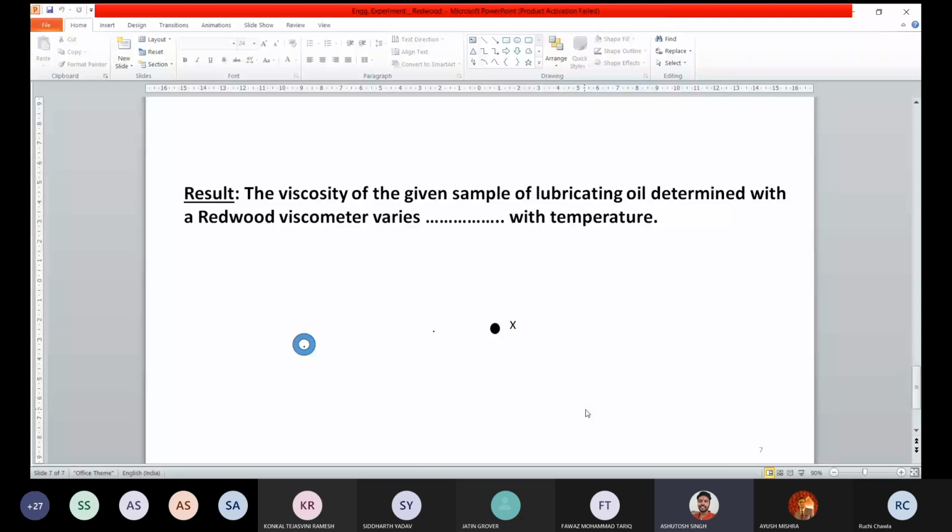Yes, ma'am. So when you make a point, it should be made with a very light hand, with a pencil you will be using on the graph. Now, if that point has been located on the graph, there is a possibility that it won't be that visible. There may be a possibility that you're not able to see it very clearly.